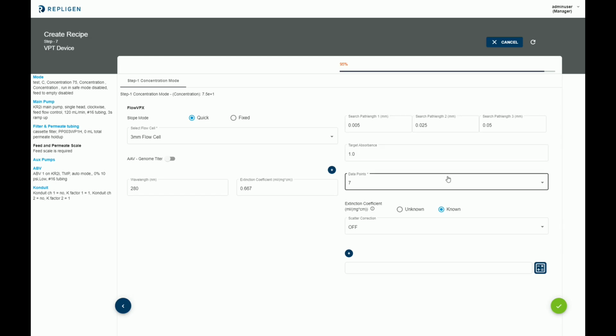And then on here is something we don't really recommend changing. This is our search algorithm for both the Solo VPE and the Flow VPX. However, if you would like to change this to match your process more, you could always work with me. That's part of my job role, to help you guys post sales to maximize the efficiency of your process. Okay, so that is making the method.